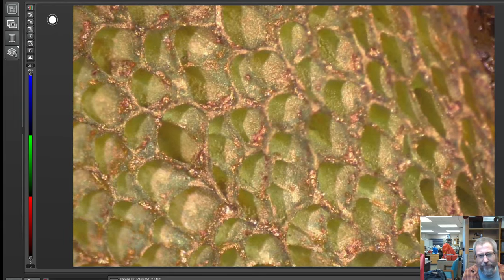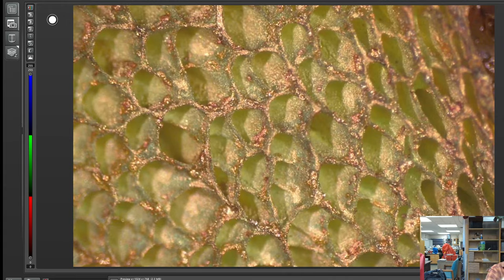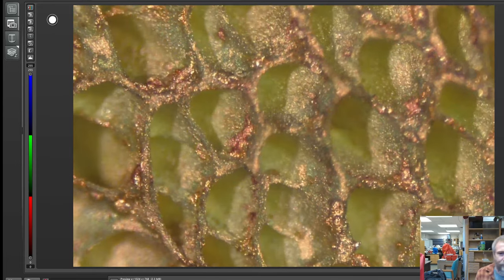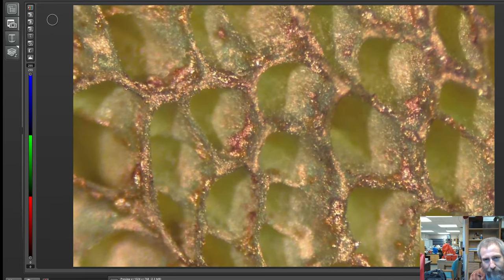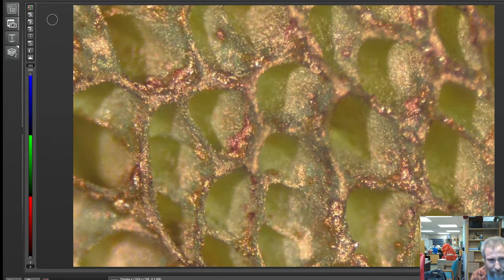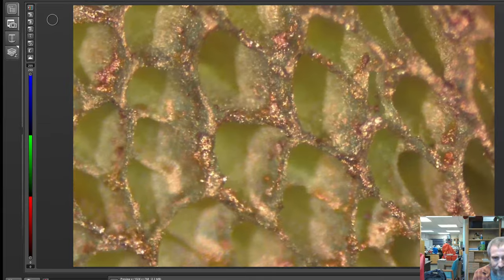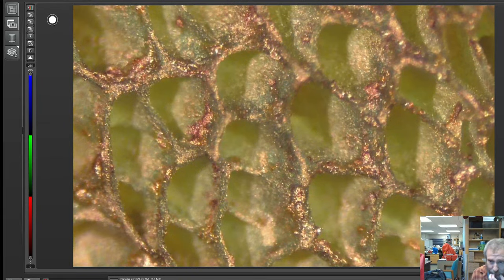There you can see we were in one of these things looking around, and I said, oh, I could kind of get that view in my stereoscope, and this is maximum zoom on my stereoscope, so we saw a view not dissimilar to this. I took a picture that was kind of like this, only it wasn't in color, and I actually have an extender for my stereo microscope that would double the size of this image. So I've got a 2x multiplier that I can put on it.